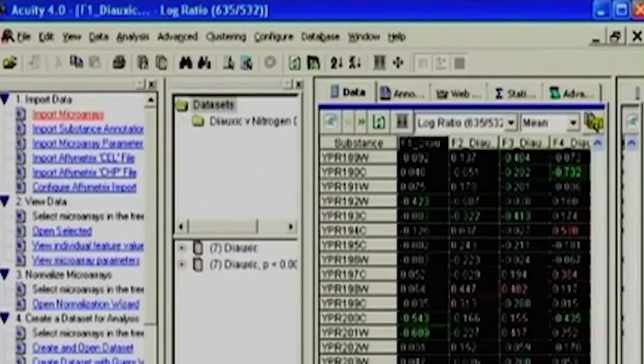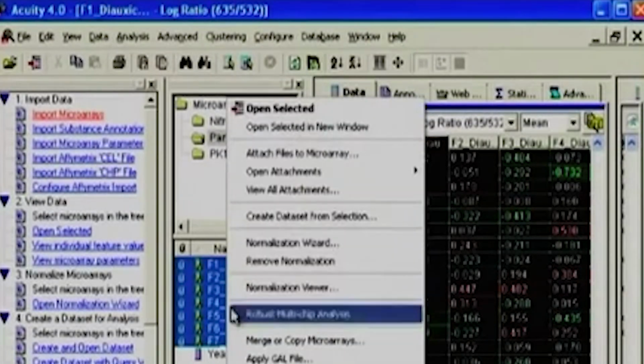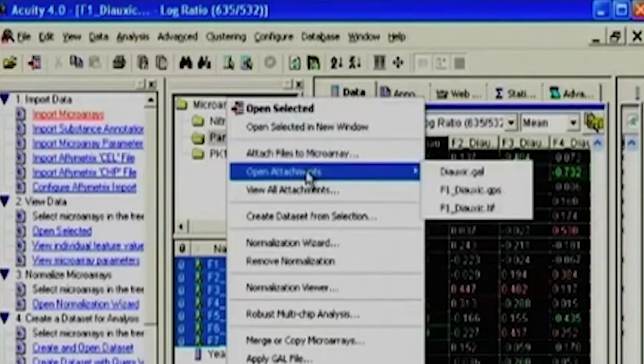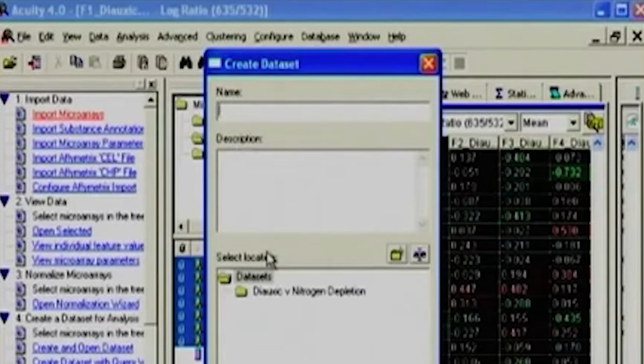Let's quickly see how we can do that particular job. So I can select my data, again holding the shift, I can click, and it will tell me what you want to do. It says you can have different kinds of opportunities, but you can create data sets from selections. This allows that whatever I have selected, I create a data set from that. Once I click that, it asks where you want to keep it, in which folder. So beforehand I can generate my own folders, I can define my studies, and I can place them.